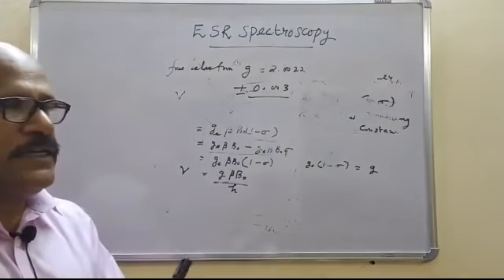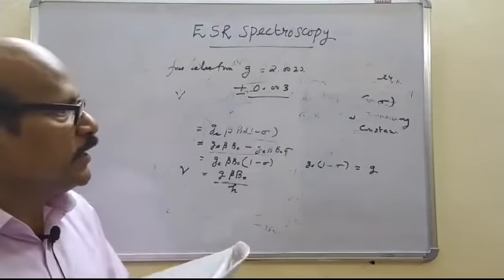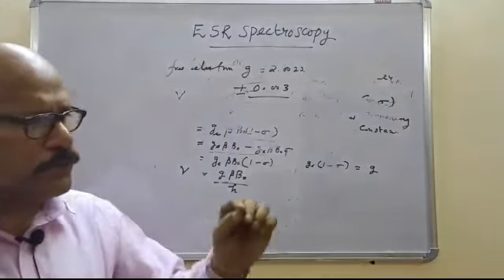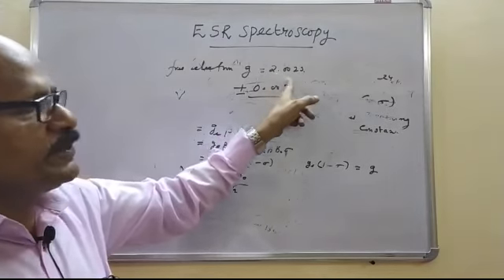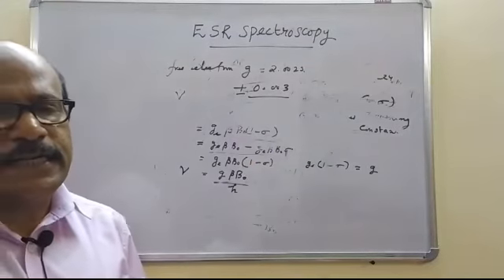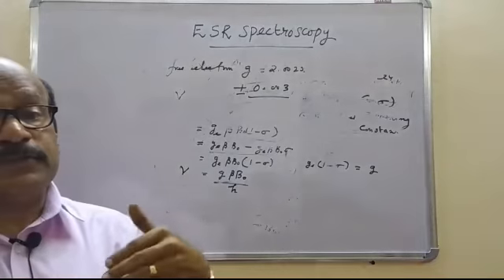Okay, that is why for most of the free radicals, from compound to compound, the values differ very, very little, very close together, with a 0.003 difference, plus or minus, from this value. So we find a difficulty in analyzing the other radical from the free electron, or from one compound to another.